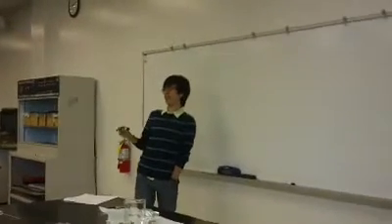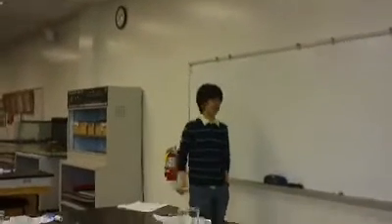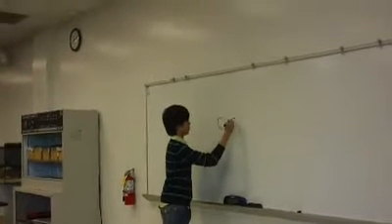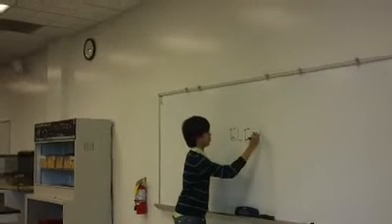Ago, you probably have an idea of what I was saying. If not, we'll rehash. So today we're going to be doing a special reaction. It's called the ELISA reactions.